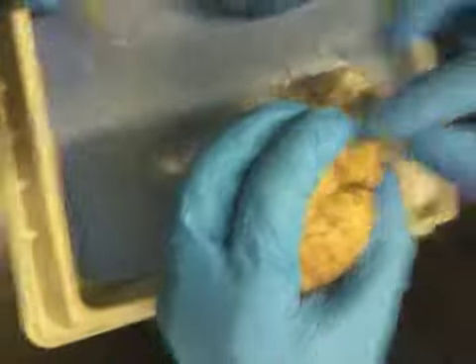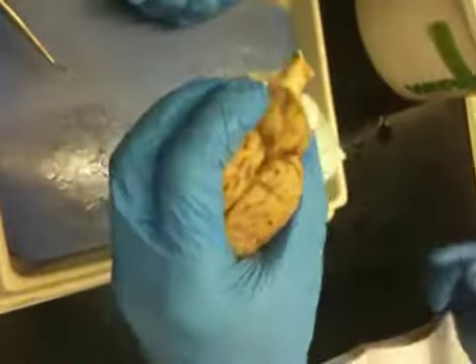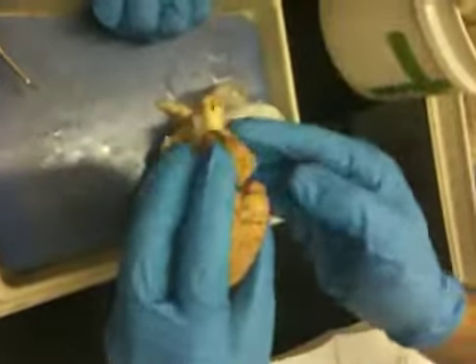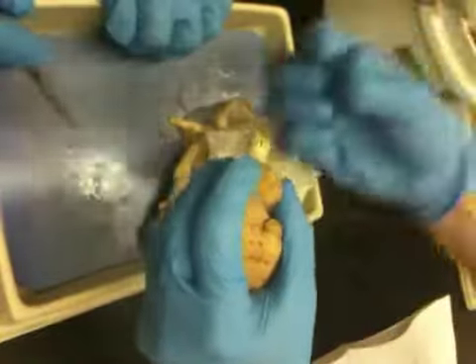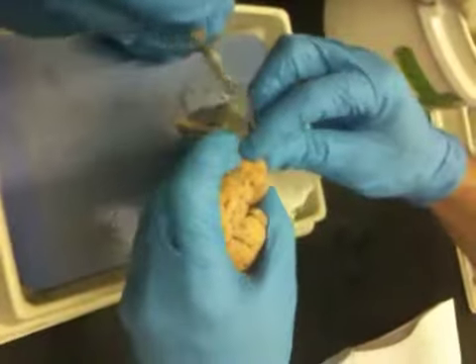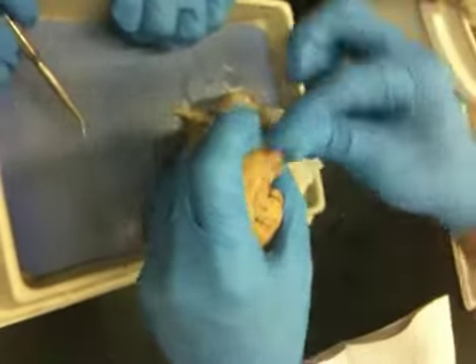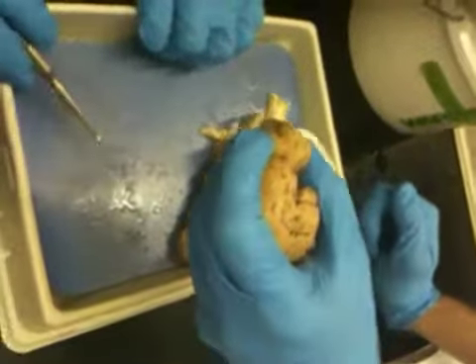Vermis refers to this ridge on the cerebellum up here. So it's the equivalent of the fissure here. It's not a fissure, it's a bump. Oh, it's a bump itself, not the line. Vermis is a bump. Yep, I guess so. So there's no separation on the cerebellum. Cool. Okay.